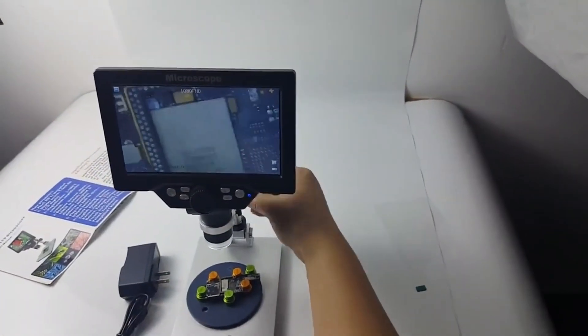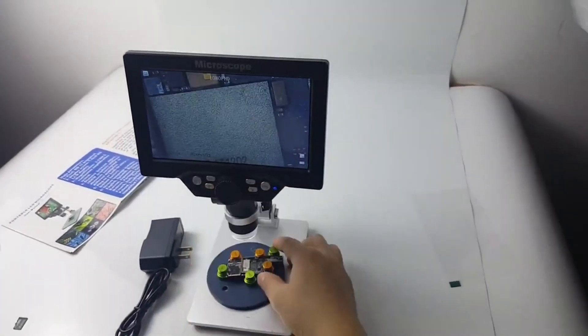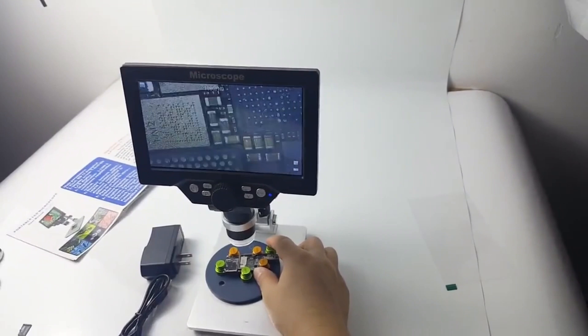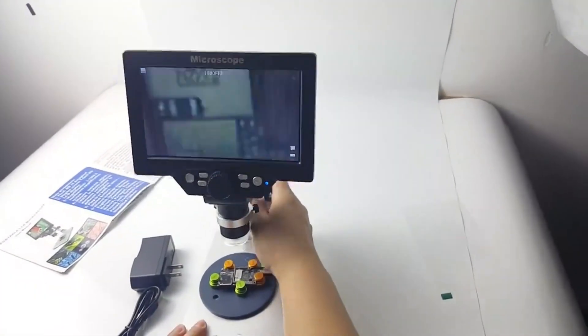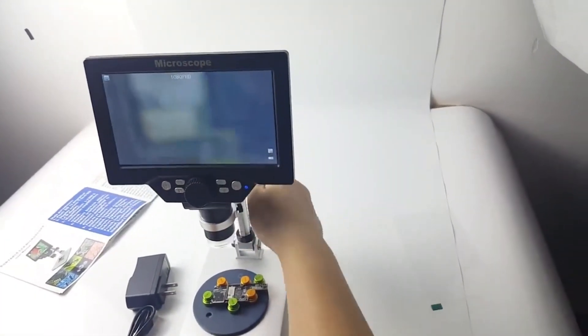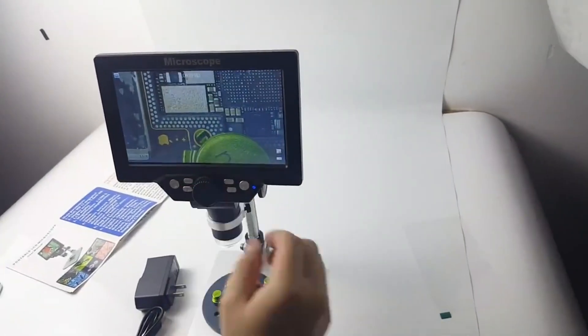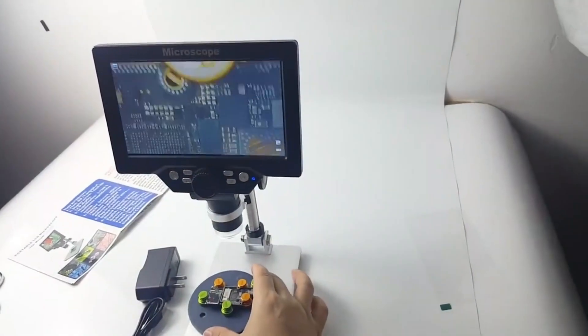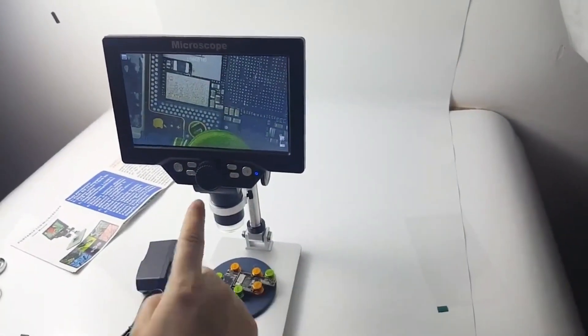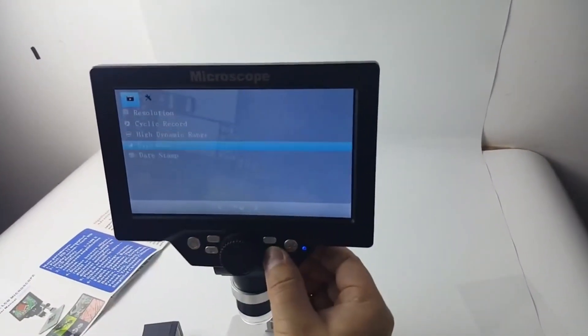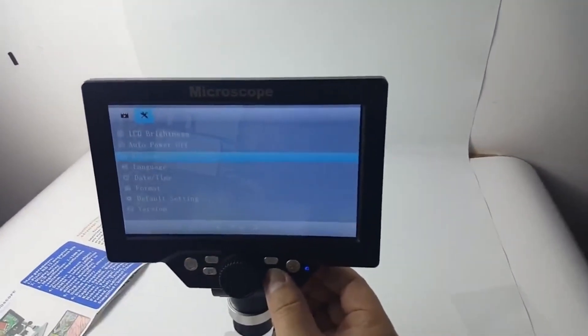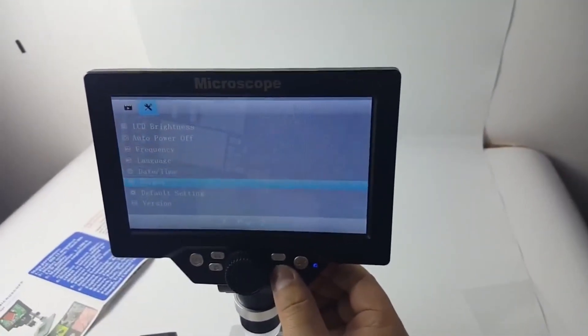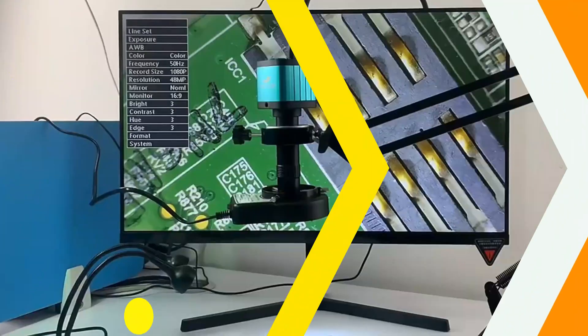The microscope offers continuous amplification with a 1-1,200x magnification range, allowing for precision zooming. The adjustable working distance from 10mm to infinity allows for study of a wide range of specimens. The microscope also supports 16 language systems, making it accessible to users from around the world. The built-in 3.7V 3000mAh lithium cell provides ample power for extended use.